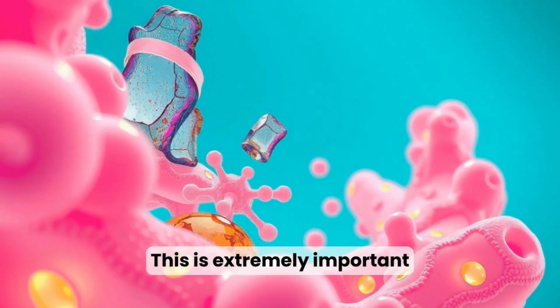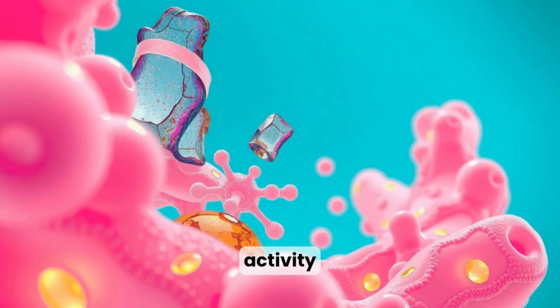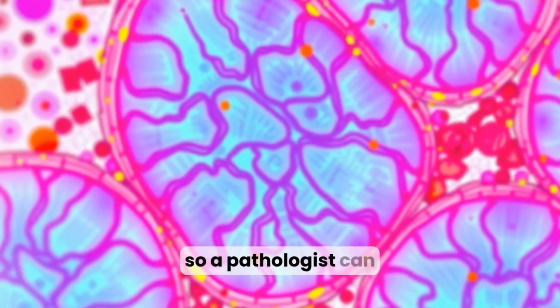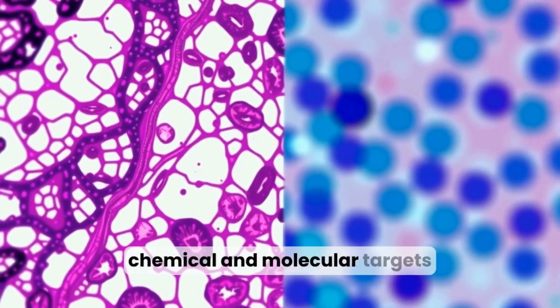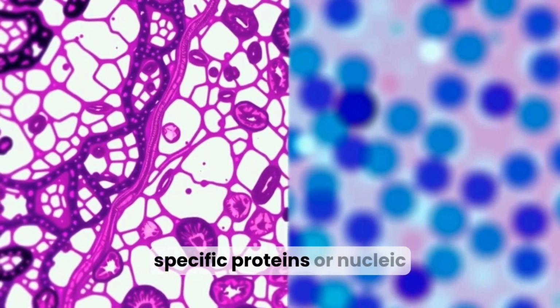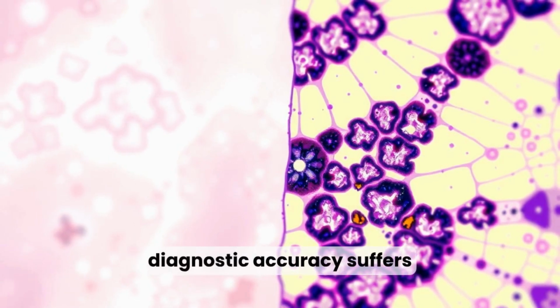This is extremely important because once tissues are removed from the body, they are prone to rapid degradation due to enzymes and bacterial activity. Proper fixation preserves morphology and cellular detail, so a pathologist can accurately interpret structure and disease-related changes. Fixation also preserves chemical and molecular targets so special stains and immunological tests can detect specific proteins or nucleic acids. Without reliable fixation, microscopic interpretation becomes unreliable and diagnostic accuracy suffers.